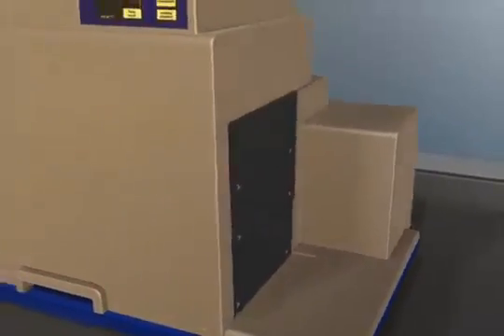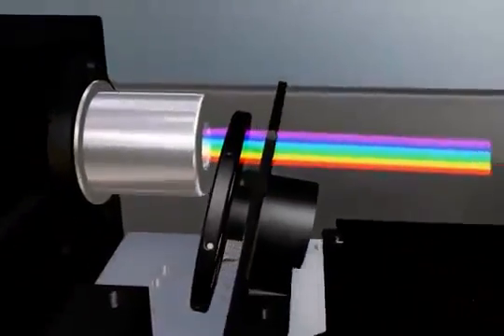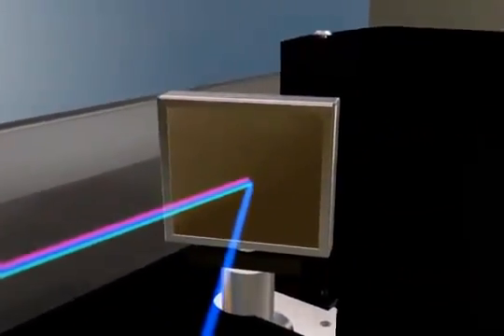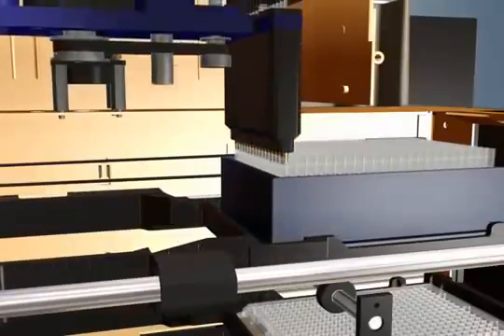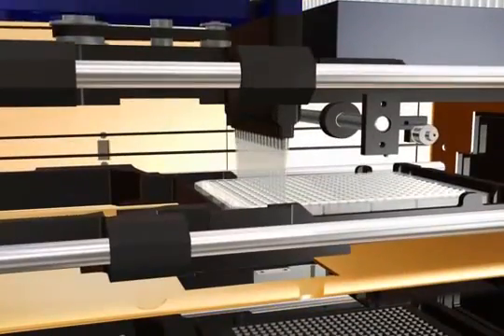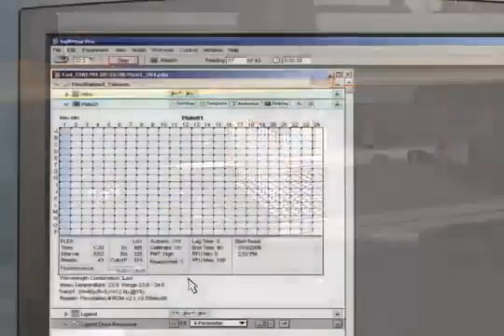The FlexStation3 system is based on the SpectraMax M5e multi-mode reader and uses monochromator-based smart optics to select the desired wavelengths for your assay. Using the Flex Read feature, the assay plate is read from the bottom to obtain the baseline signal while the pipetter head loads tips from the tip drawer, aspirates compounds, and then transfers the compounds to a column of the assay plate.